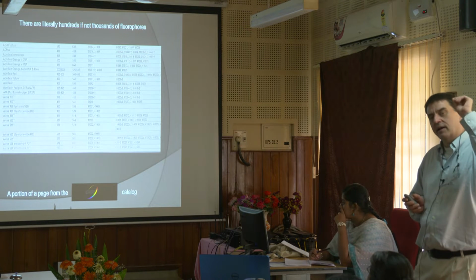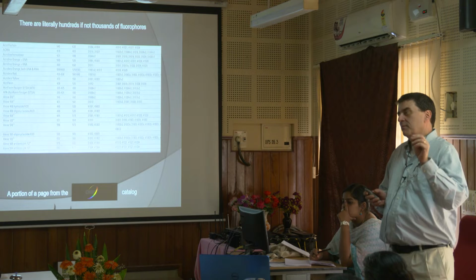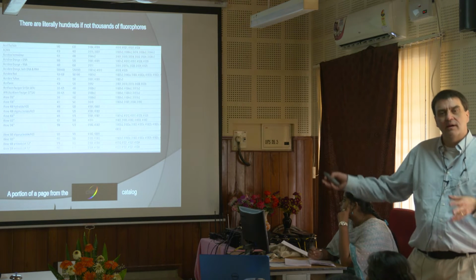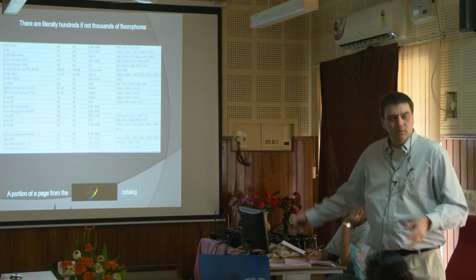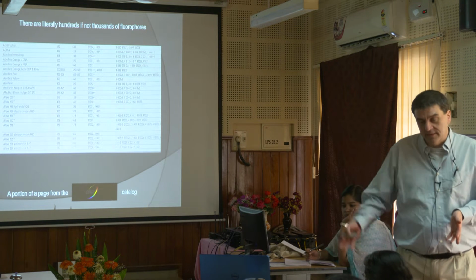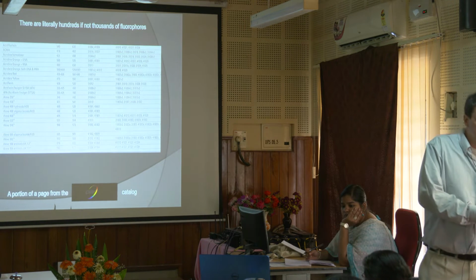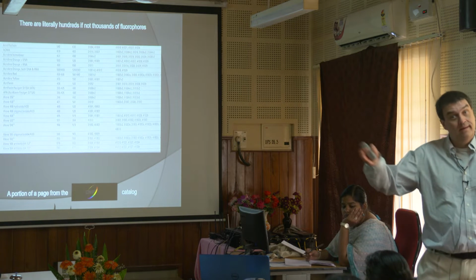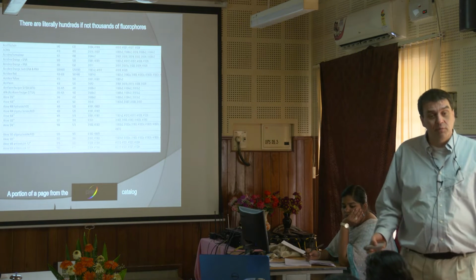So again, I cannot emphasize again and again, before you even start an experiment, before you do anything, if you want to use the confocal here, go down and talk to them at the confocal and say, I'd like to do this experiment. What dye should I use? And he'll tell you the correct dyes to use. And then when you go do your experiment, hopefully it'll work. But if you use the wrong dyes, it's not going to work, period. They won't be able to look at it.